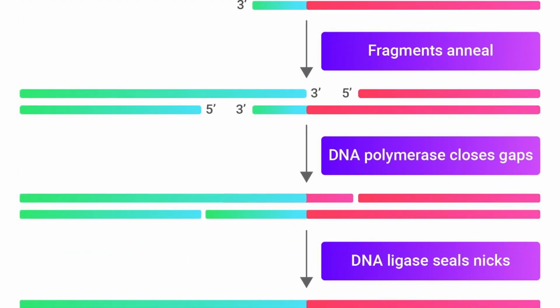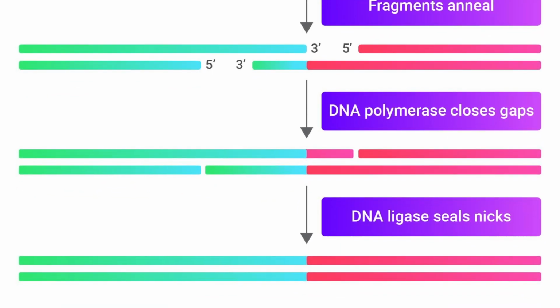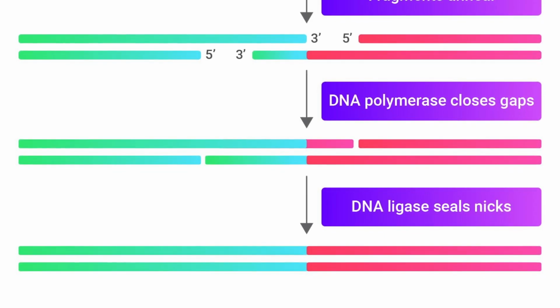Next, in the final steps, a DNA polymerase and a DNA ligase are then used to fill the gaps and seal the nicks, leaving you with the final product.